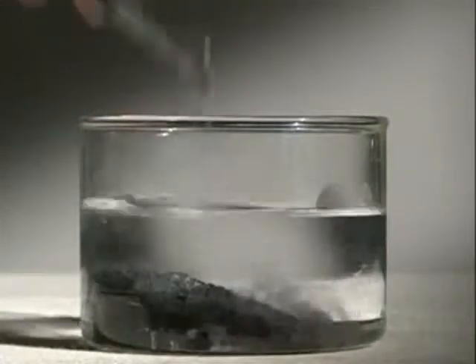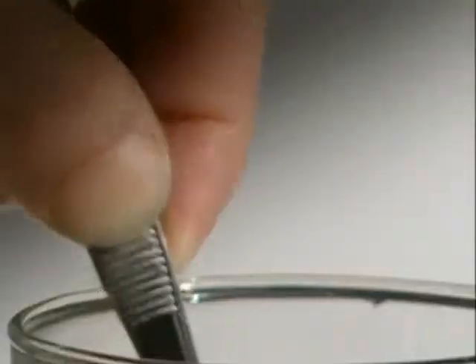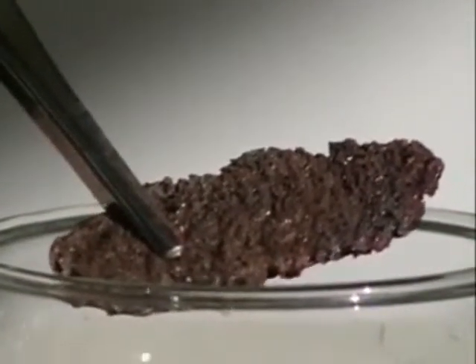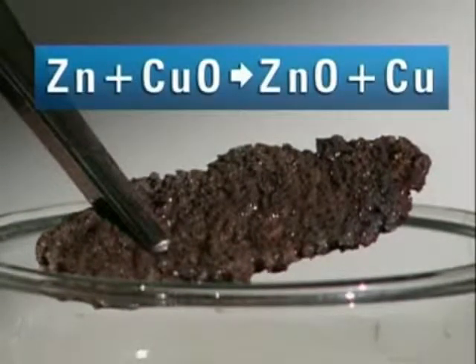Place the remaining solid in dilute acid and after a few minutes you can see pure copper. Zinc has reacted with the oxygen in the copper oxide, leaving copper behind. So zinc is more reactive than copper.